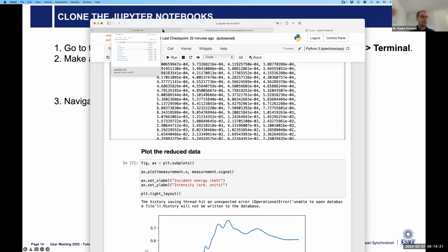So another approach is to take your data and put it in something more widely used than the HDF5 file format that ESRF uses, and then have the analysis library treat this more general format. Maybe it's not going to be a standard for everyone, but at least it's used by the community. That's another way to approach the issue. Yeah, that's something that can be solved.